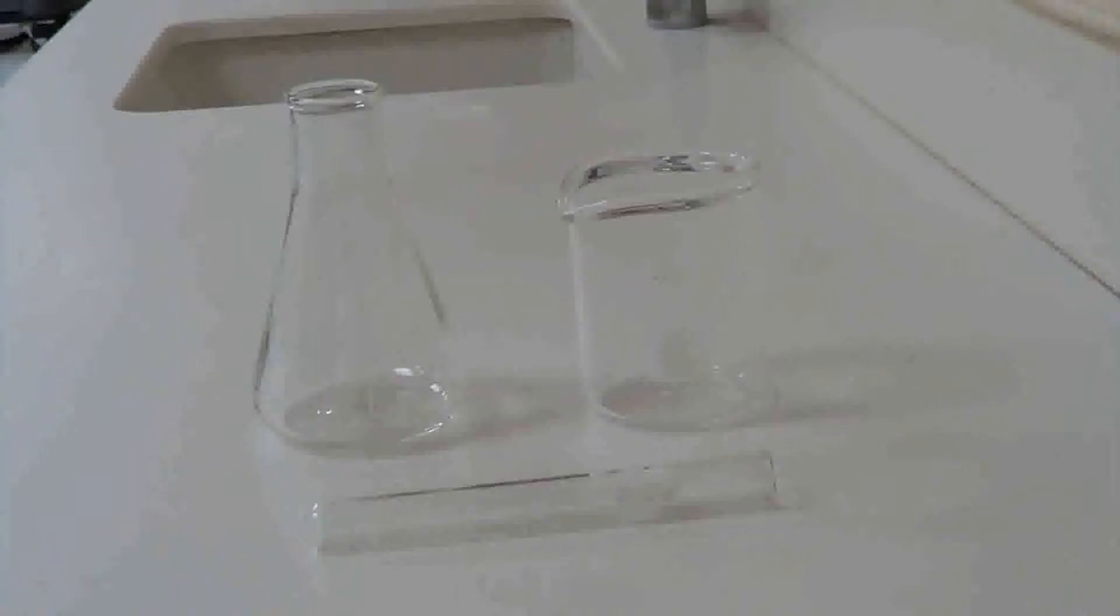First, as soon as any glassware breaks, notify everybody around you and immediately get out of the area. Don't try and clean it up yourself. We don't want you to get cut. We don't want you to be contaminated with whatever chemicals might be in there. So again, as soon as glassware breaks, notify everybody in the area and clear out the area.